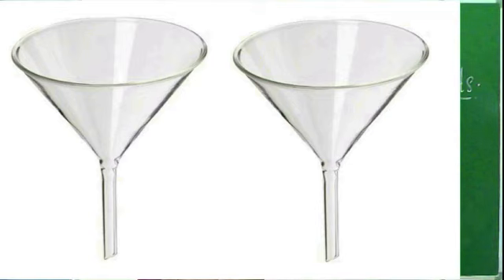Funnel is cone shaped with a stem at its narrow end. Made up of glass or plastic. Normally, glass funnels and plastic funnels are available. In your home also, we can see funnels. This funnel is used to transfer the liquids from one container to another container.